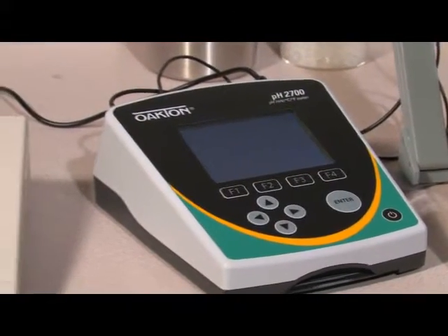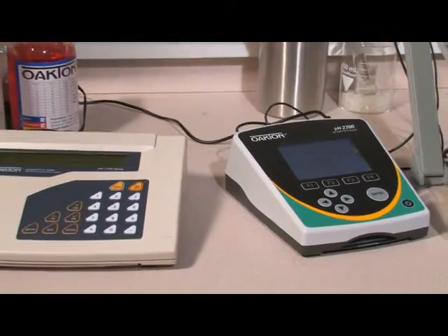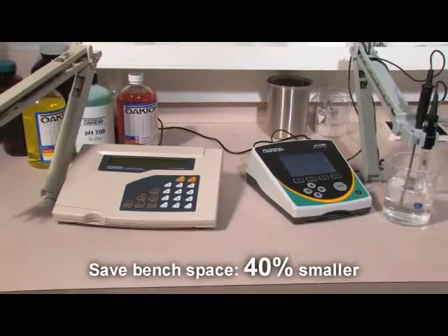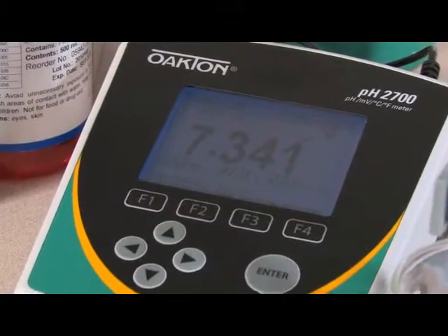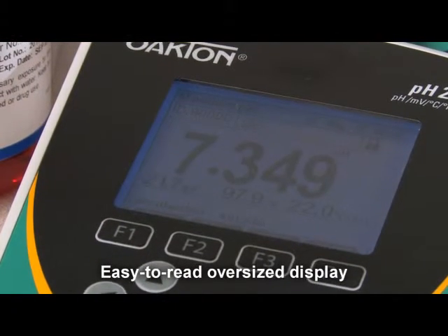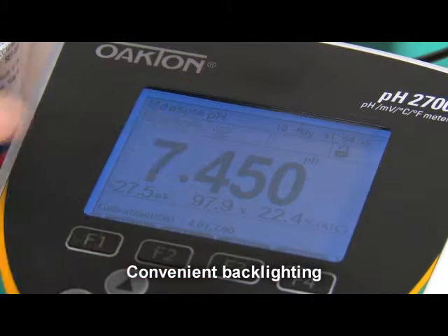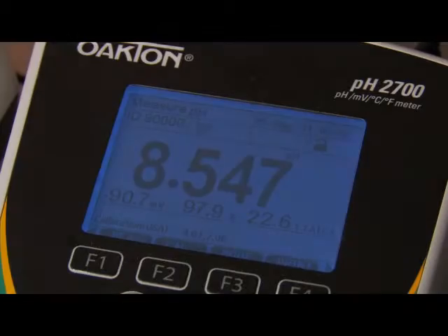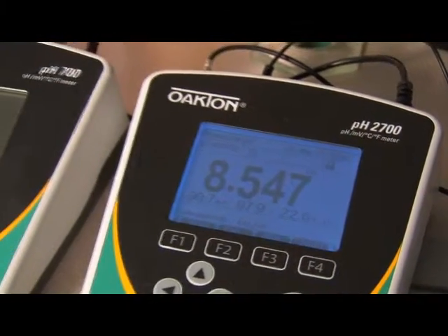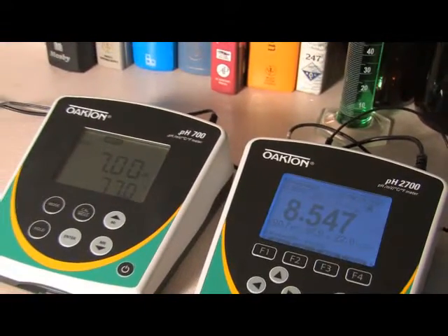Because lab space is at a premium, we have reduced the footprint of the 2700 meters so they take up less space — 40% less than other meters. Plus, the increased size of the display lets you view readings from nearly anywhere in the lab. Backlighting helps you view the display under all types of lighting conditions. See the dramatic difference when comparing the backlit display of the 2700 model to the non-backlit display of the basic 700 model.